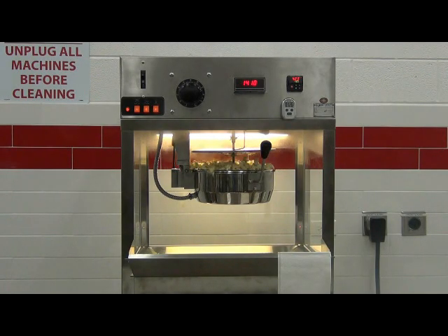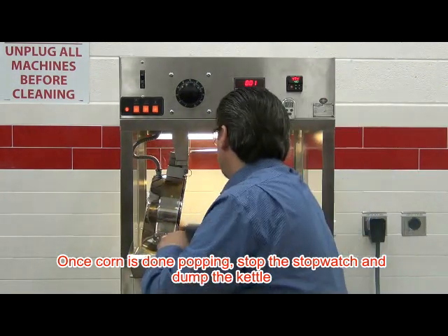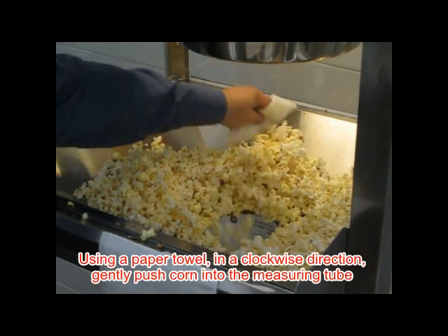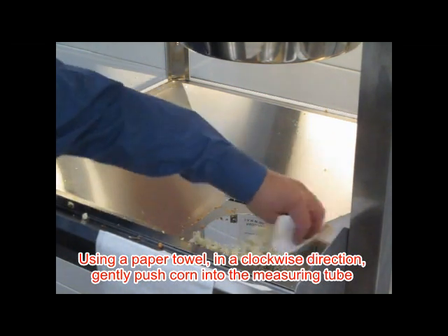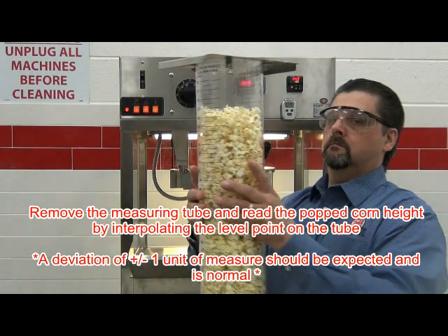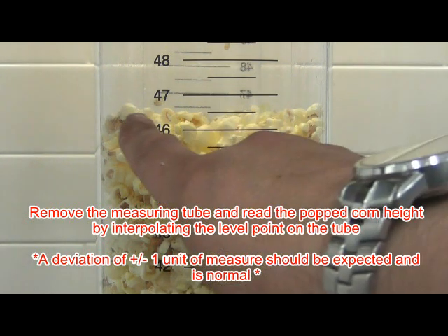As before, the corn will begin to pop. As it pops, it will push up the automatic cover lid and the popped corn will dispense into the hopper and fall into the measuring tube. When the corn is done popping, stop the stopwatch and dump the corn into the hopper. Starting on the left-hand side and moving clockwise in the hopper, gently brush the popcorn into the measuring tube. Be careful not to unnecessarily pack the popcorn into the tube. Carefully remove the tube and read the popcorn height by interpolating the level point on the popped corn column. Record the MWVT reading for sample A in units of cubic centimeters output per grams of corn input, and also record the cycle time.